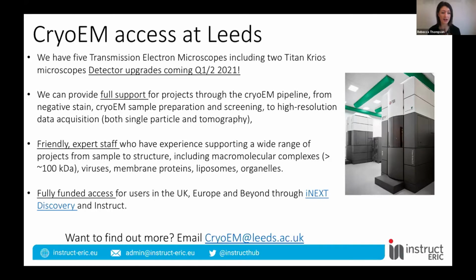enhanced support. So this is where you might just have some biochemical analysis of your protein. You might have never done any electron microscopy before on that sample. But through this enhanced support pipeline, which we offer through Instruct, you can ship us your sample. In normal times, you could come and visit, and we will be able to guide you through that pipeline, perhaps doing negative stain first and then cryo-EM grid preparation workup. So this is a really fantastic opportunity for researchers who perhaps aren't experts or don't have any existing knowledge with a particular technology to gain access to these cryo-EM workflows.